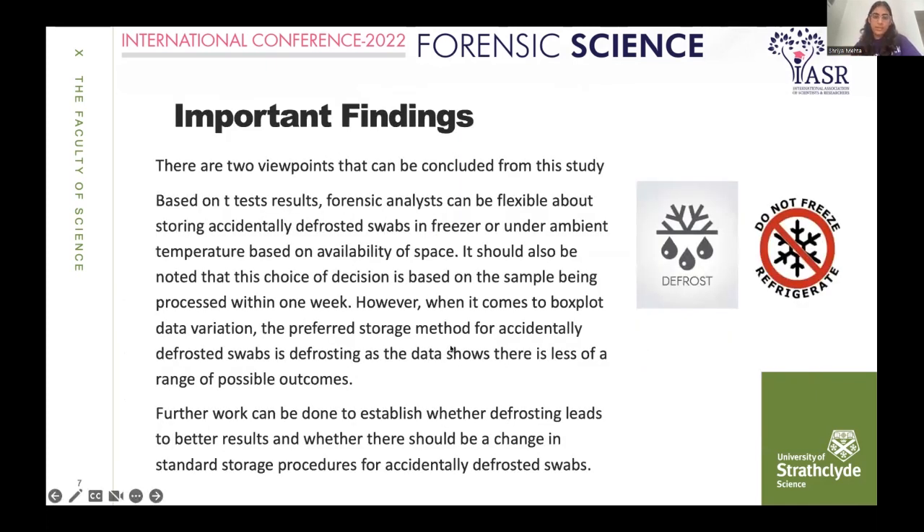From the study, there are two viewpoints to conclude. Based on the T-test, forensic scientists do not have to worry about which storage method to use, provided they store accidentally defrosted swabs for only a week before processing, as T-testing shows no significant difference between defrosted and refrozen swabs. However, from the boxplot data, the preferred storage method appears to lean toward the defrosted side, because defrosting data shows less variability, less possible outcomes, and therefore more reliability of that DNA level.